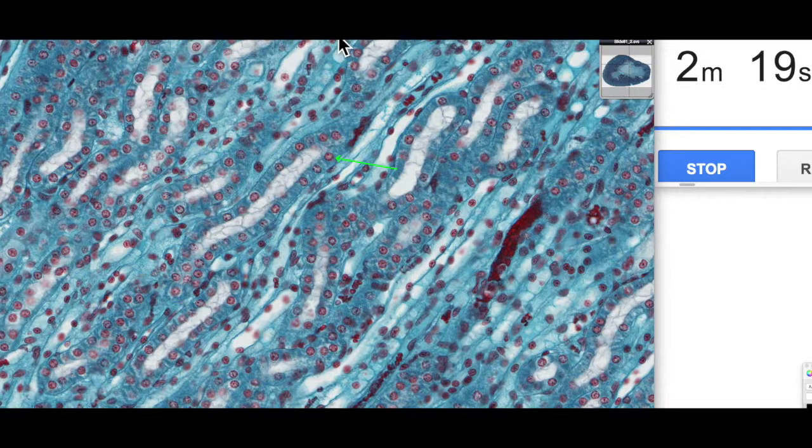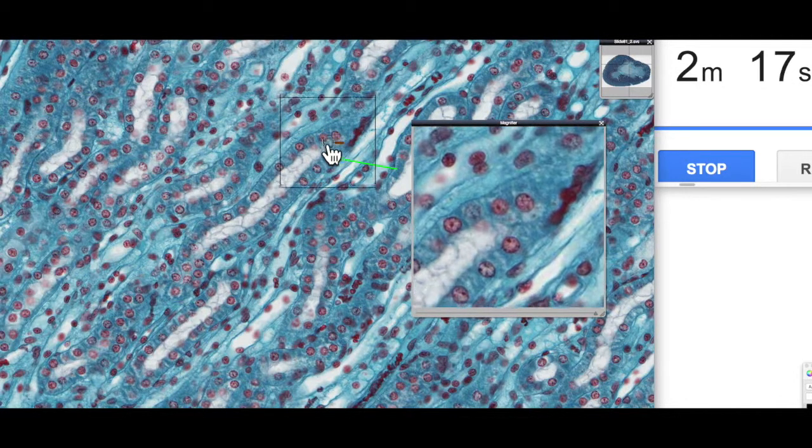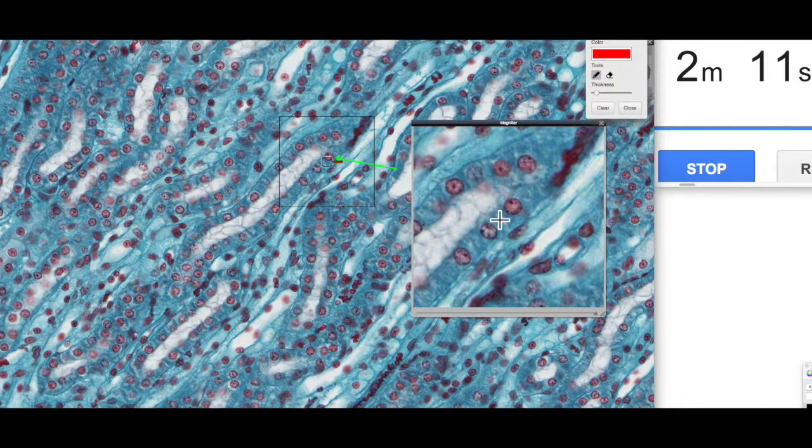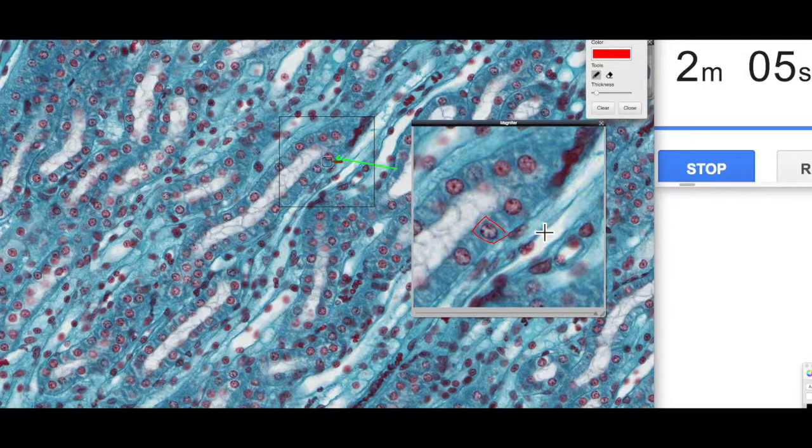Let's have a look at this in a little bit more detail. We can actually see that if we think about it, this cell is quite square-shaped. Unlike my drawing there, quite cube-shaped. So typical cube shape.